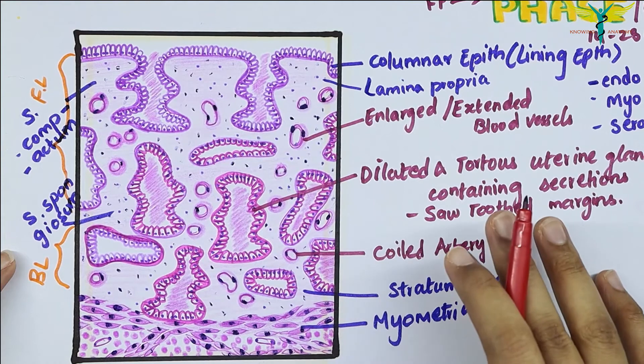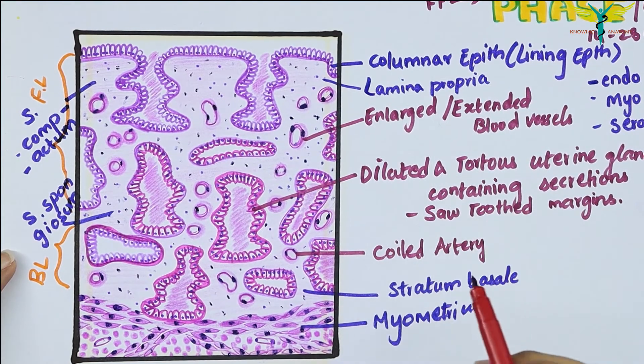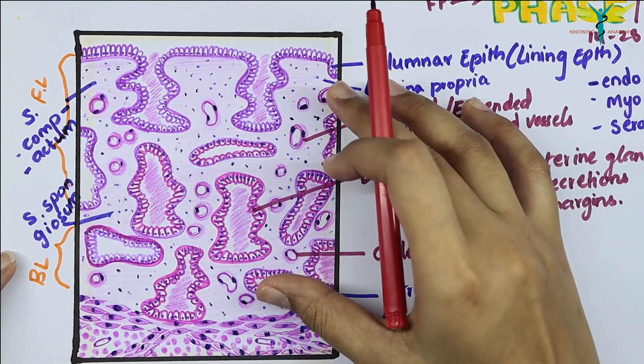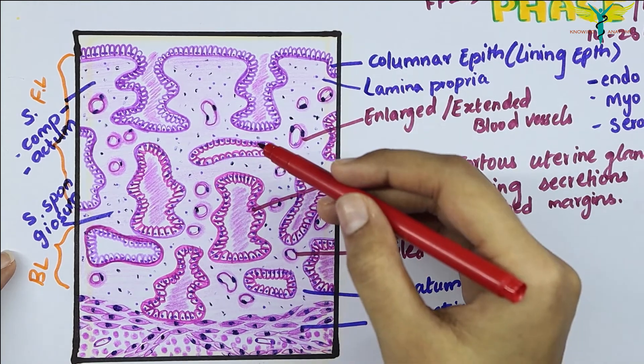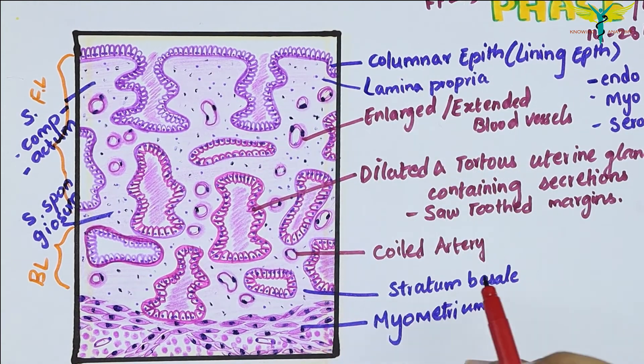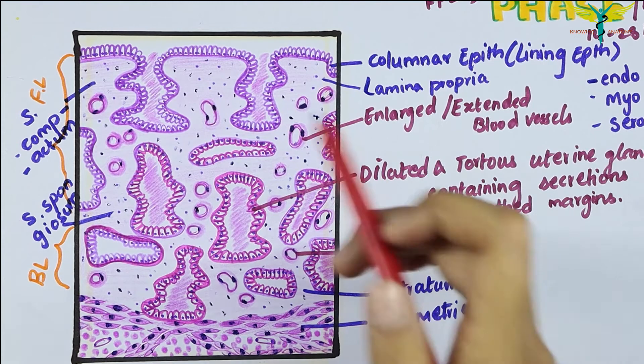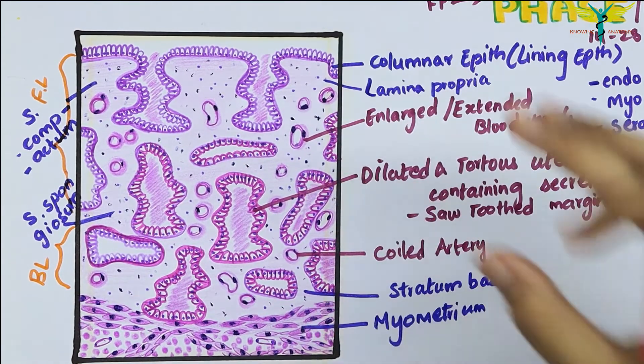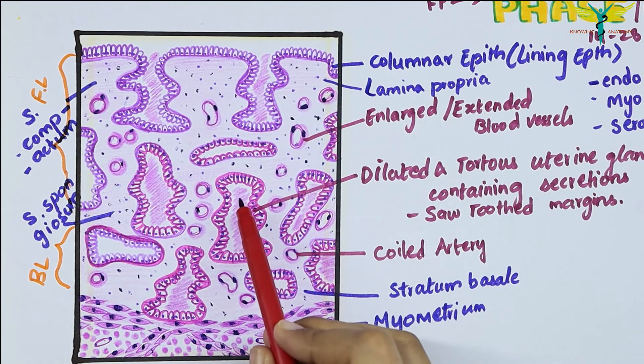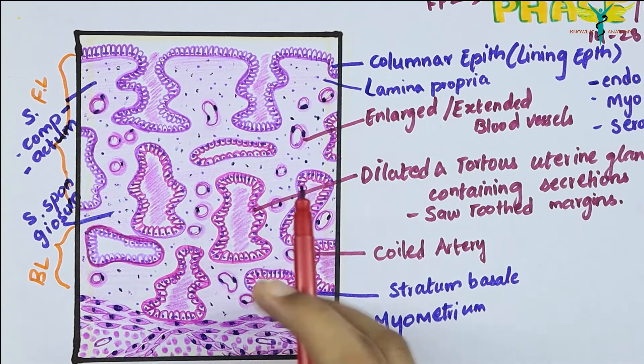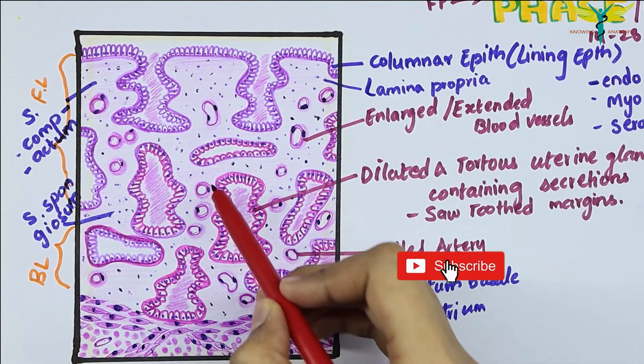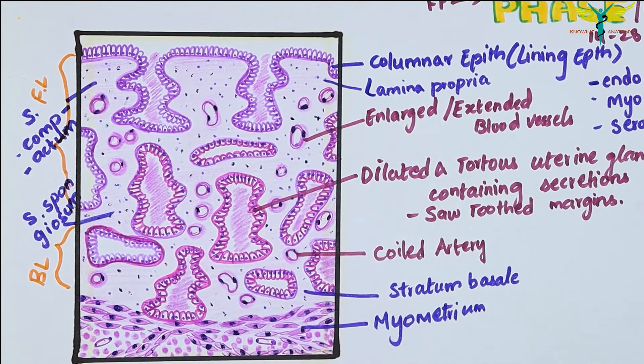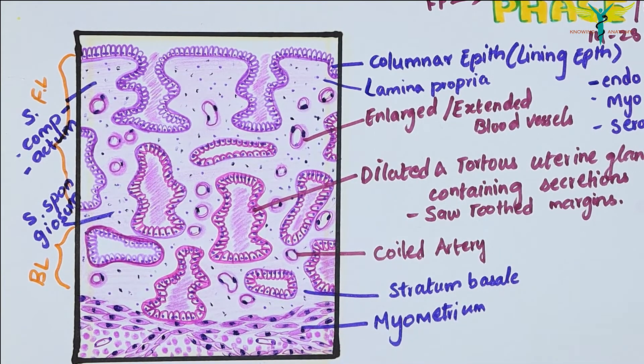It's easy to distinguish between the secretory phase and the proliferative phase of the uterus because the endometrium becomes so distinctive that the uterus cannot be confused with any other organ. You can see the dilated and tortuous uterine glands, the thickness of endometrium increases, and these tortuous dilated uterine glands contain secretions and they look like saw tooth margins.